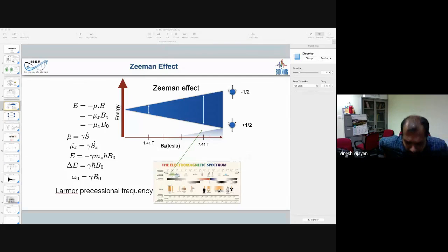These are going to be broad because of the quadrupolar coupling. Quadrupolar coupling is quite heavy and the peaks will be very broad, unless you get sharp peaks if you have very good symmetry in your molecule. So that is a possibility. And I am only talking about solution NMR. There is, of course, solid state NMR, and that's a completely different thing. Normally, solid state NMR mainly deals with these quadrupolar spins.